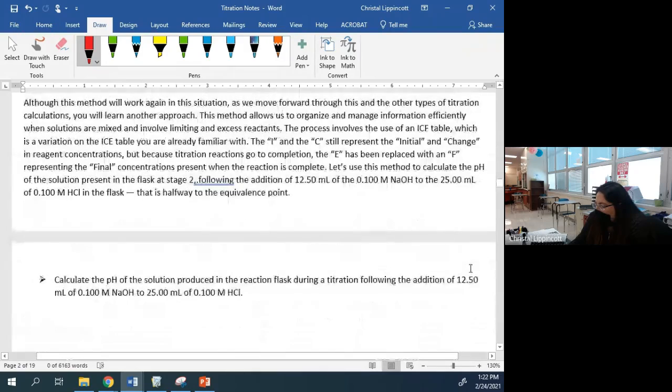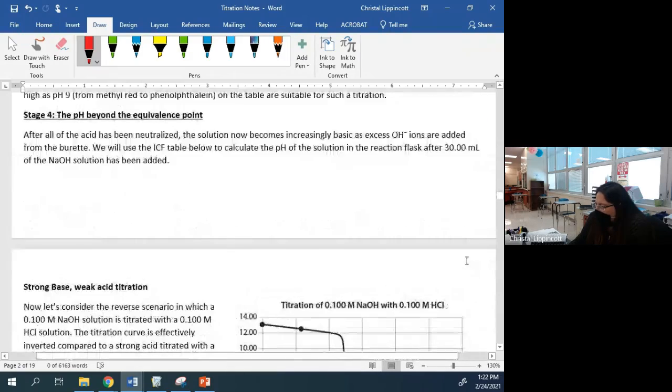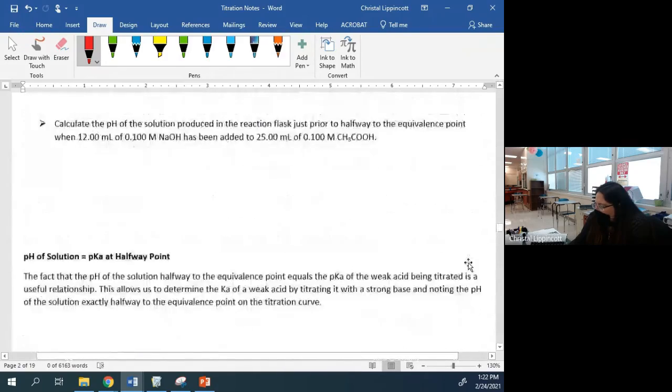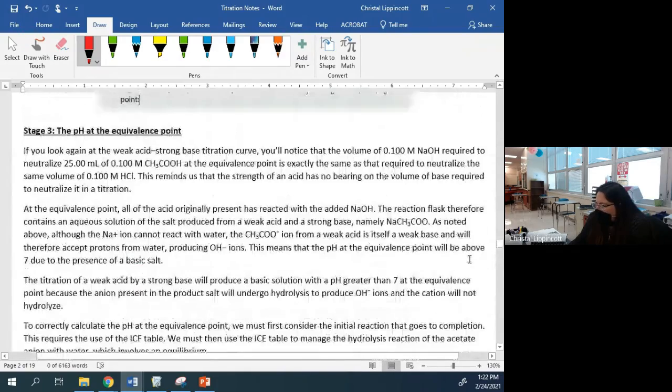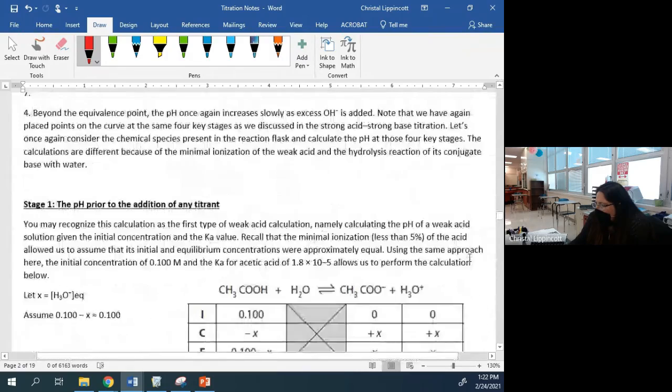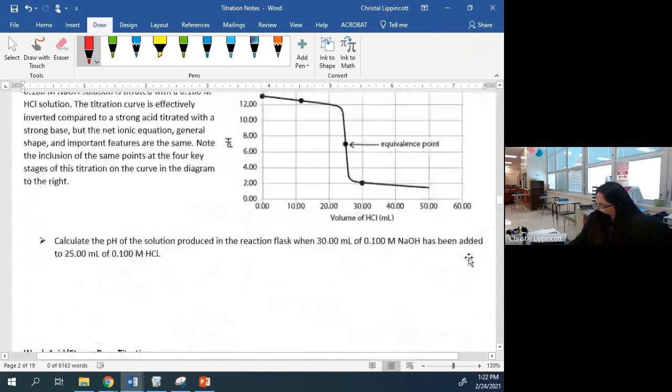Assuming we have them. I don't even know which ones we have back there. I know we've got phenolphthalein and we've got universal indicator. Those are the ones I know for sure. The other ones I keep back there are mostly for biology folk.